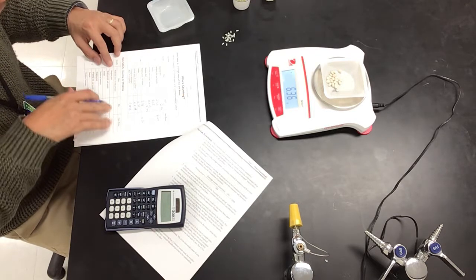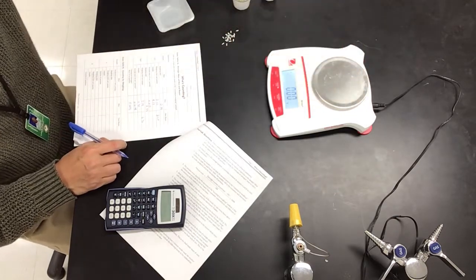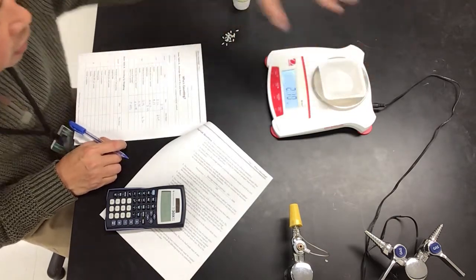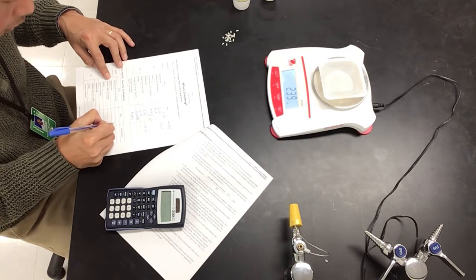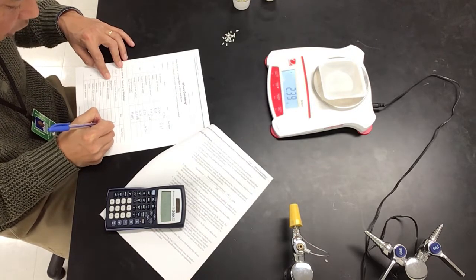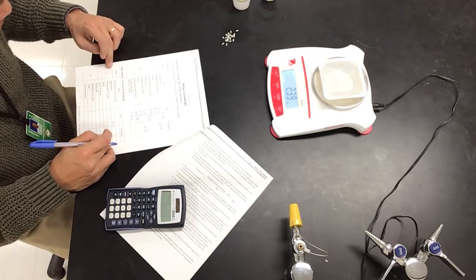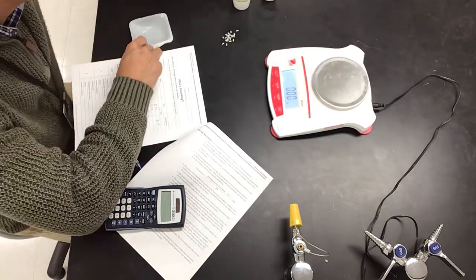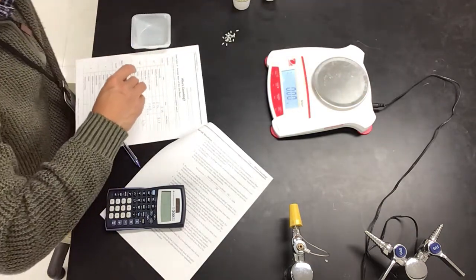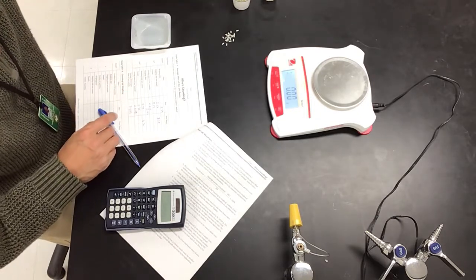The weighing dish, in this case for the 10, is still 2.39. You're going to predict this part. Weighing dish and sample. In this way, I'm going to put 100 grains of rice. I already counted them. Did I forget to put them out?